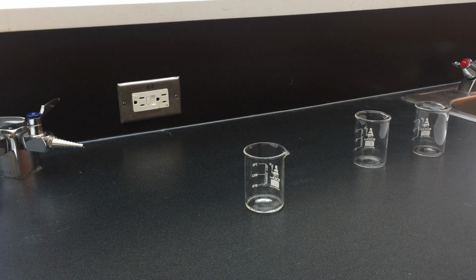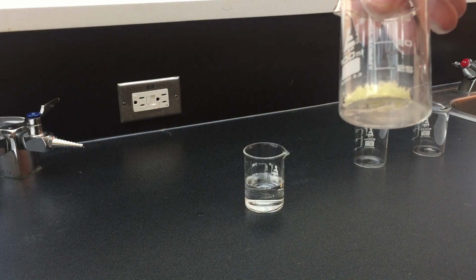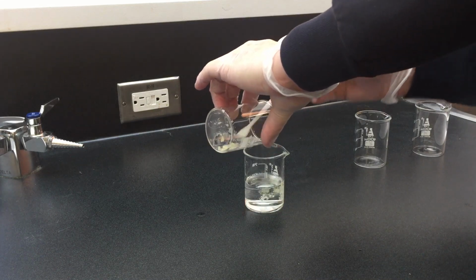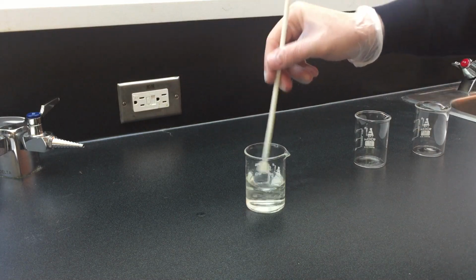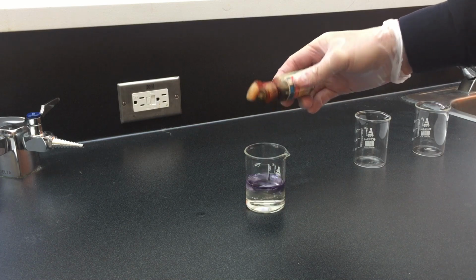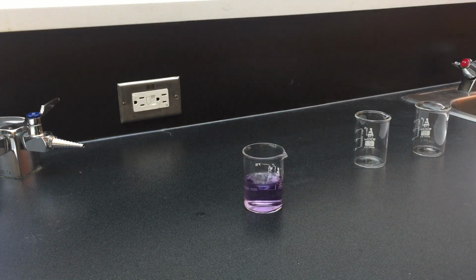So into my water, I am going to dissolve the amine. So just a little bit of distilled water and very little 1,6-hexadiamine. And 1,6-hexadiamine dissolves quite well in water, and will form a very basic solution. I'm going to put a little drop of universal indicator in there to indicate, yep, it's basic. It is a purple solution. That tells me it is significantly basic, as one would expect from an amine solution.